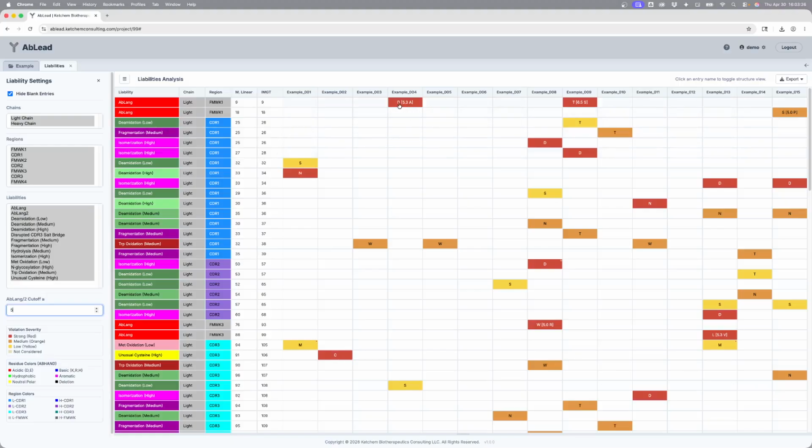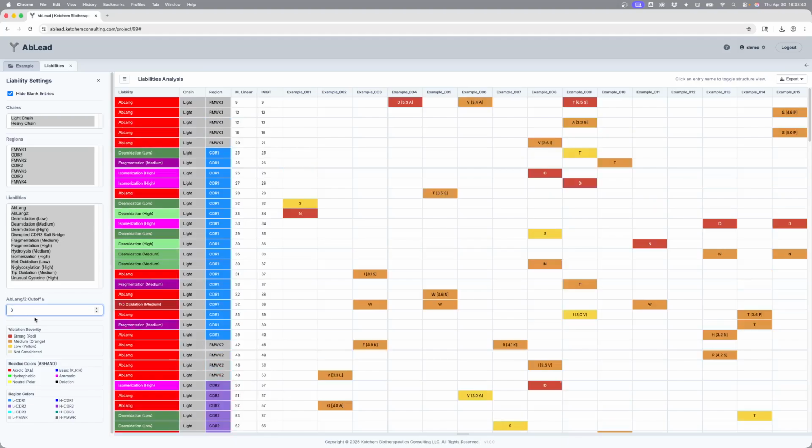For example, here the parental is an aspartic acid. It should be an alanine, the language model thinks, in the context of that sequence, at a difference of 5.3, which is a pretty strong difference. I'll leave this set to 3 for illustration purposes.